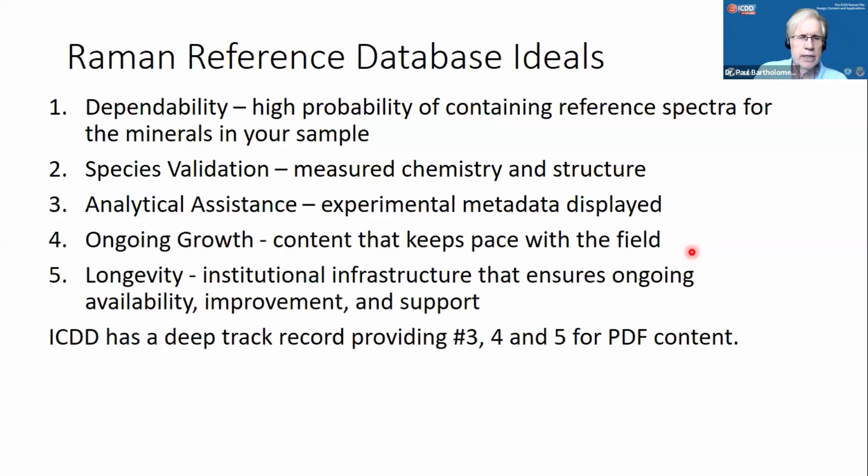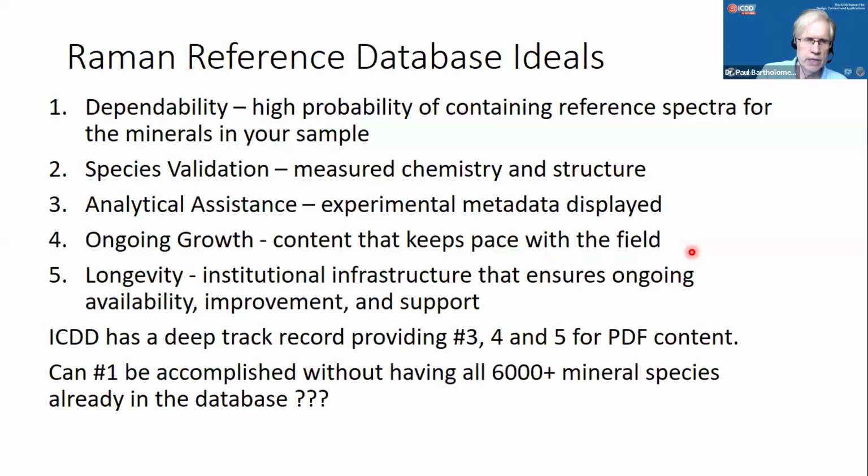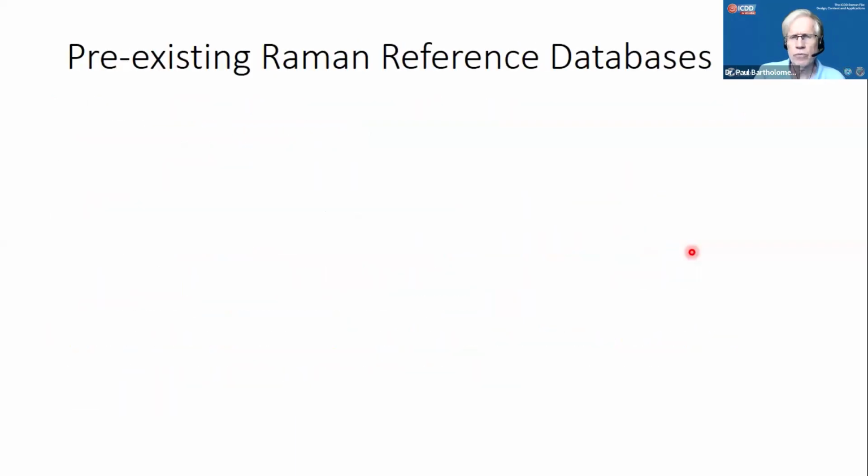Now, ICDD has a deep track record for providing analytical experimental metadata, ongoing growth and longevity. And one of the questions I needed to answer is, can dependability be achieved in some time span other than what it would take to put all 6,000 plus minerals in the database?